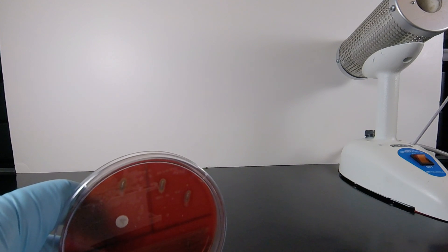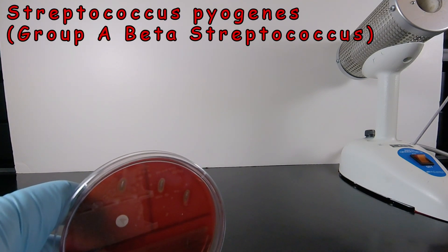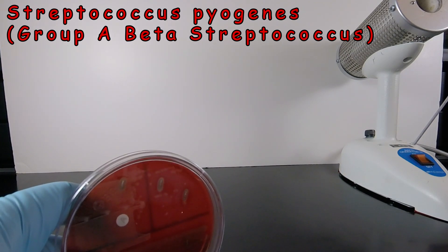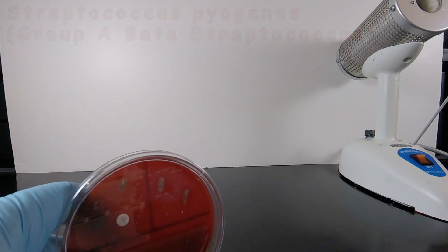One of the bacteria we're going to identify in today's lab is Streptococcus pyogenes, also known as Group A Beta Streptococcus. This is the bacterium that causes streptococcal pharyngitis or strep throat.